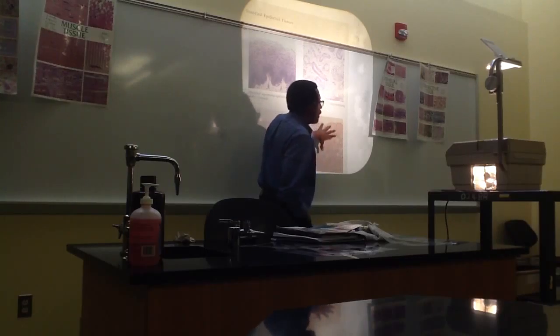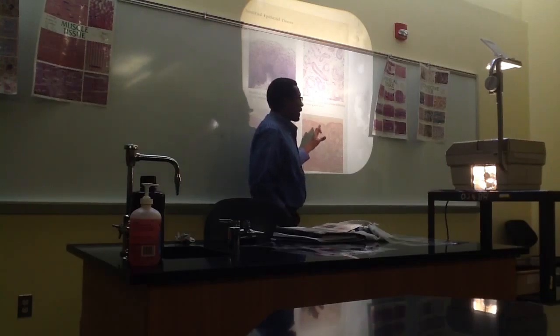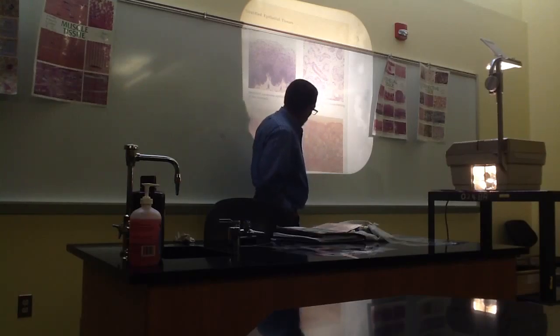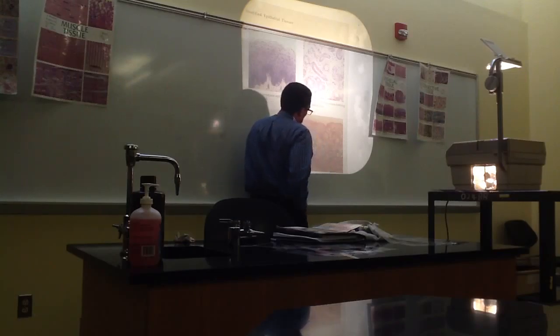All right, but it could be confusing sometimes, especially if we get ready to look at pseudo-stratified tissue. But this is really stratified. Even with the shape of the cells, it looks like they're all touching the bottom here. Yeah, because of the shape that they are, they're sort of like an oval shape. Okay, it looks like they could be touching the bottom.